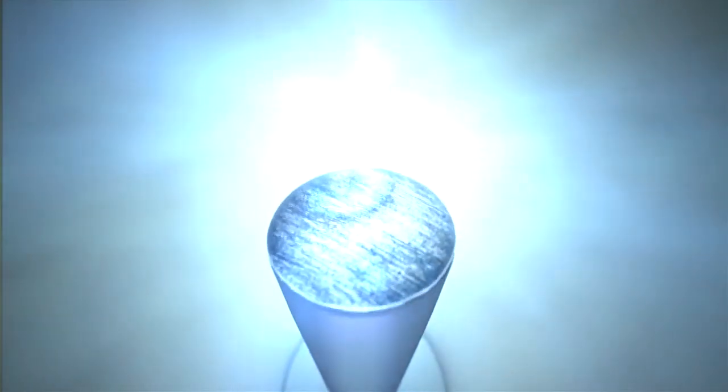We put a droplet of salty water on the tip of the piece of stainless steel in which pits can start growing. We can see how big the pit is, and then we can change the conditions and see if the pits restart or not.